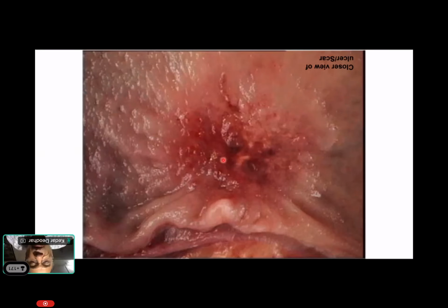And here I personally have found that palpation gives rise to, because often there is a fibrotic reaction, an irregular thickening in this area or plaque-like area, and this is where we should be taking sections from. So again, just as we saw in gastric cancer specimens, microscopy shows fibrosis, hemorrhage, necrosis, inflammation, and acellular mucin, which are not counted as tumor.